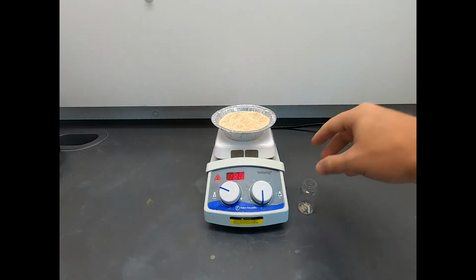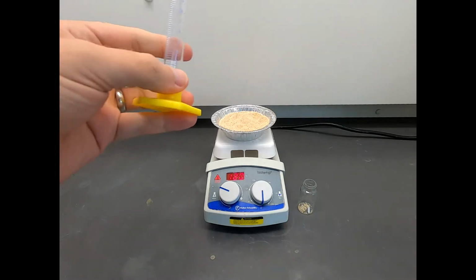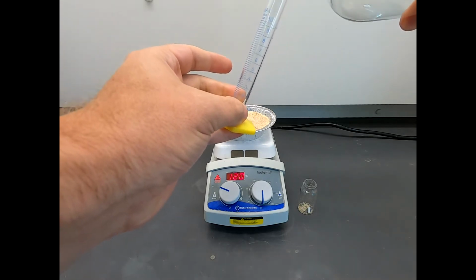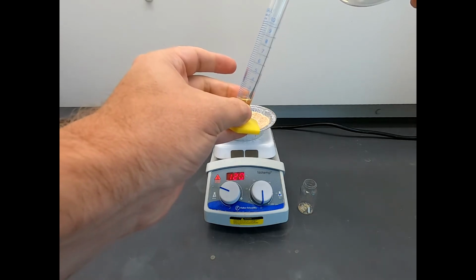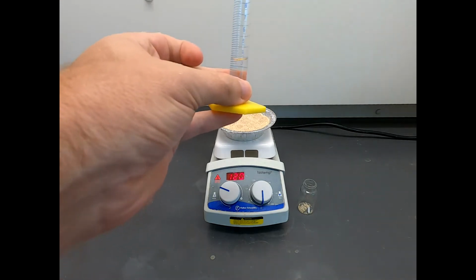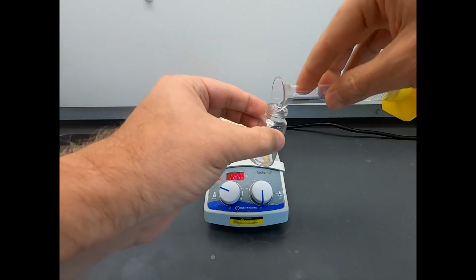And to start this reaction, we want to dissolve that hydrazide in a little bit of ethanol. I want about 3 milliliters of absolute ethanol. This does not need to be exact. Just a small amount of solvent to get everything in solution. And carefully. It's not the best pouring bottle. Okay, that's a little over, but I'm not worried about that a bit. That's really probably about 3.5 milliliters. Not an issue. Pour this in.